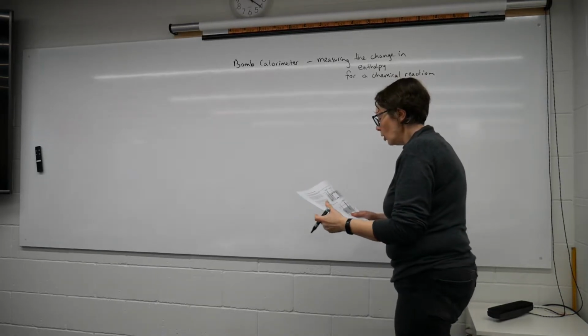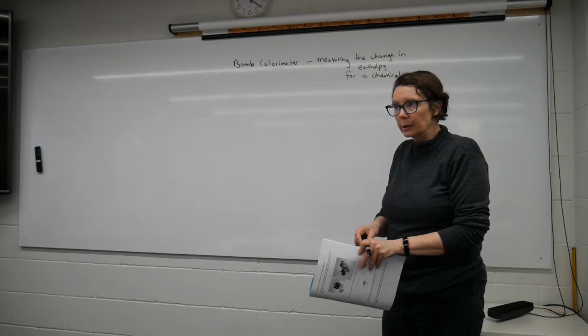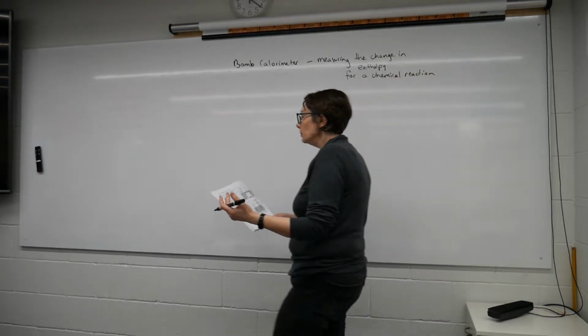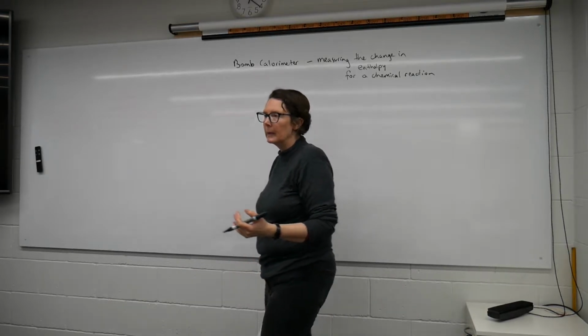Now with our bomb, it doesn't actually explode if we've done our chemical reaction correctly, but it's called a bomb because it looks a bit like a bomb.